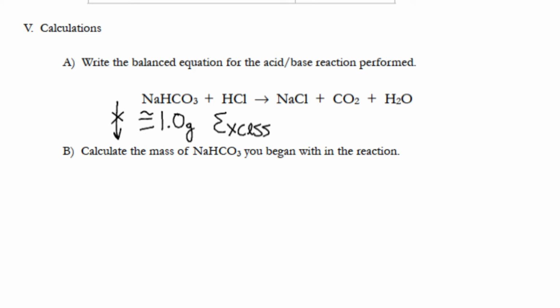Because we got to get them apart, right? So let's talk. How do we get rid of the carbon dioxide? It just bubbles away. Guys, the carbon dioxide leaves on its own. So what we're left with then is salt water. How on earth do we separate them?